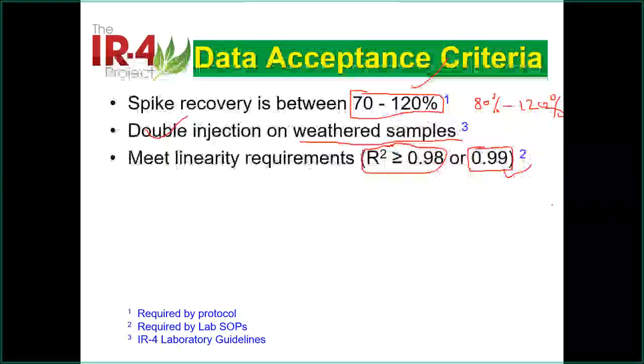So in this case, it depends on your method. You may or may not need to use internal standard. And if you do use it, make sure your method accepts that, because this is a big change. This is a major change. So the first question is, if your method does not support that, don't use internal standard. Don't make your own internal standard. Forget it.